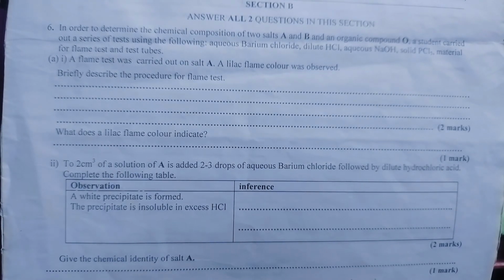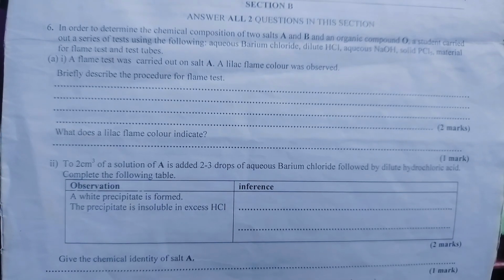Carbonates will give effervescence of carbon dioxide, which turns lime water milky. Water will turn white anhydrous copper 2 sulfate to blue hydrated copper 2 sulfate, and ammonia is a colorless, pungent gas that turns moist litmus paper blue.